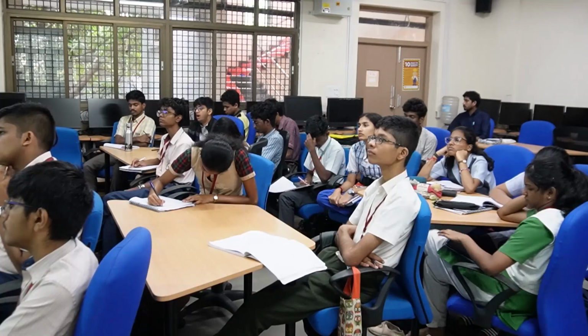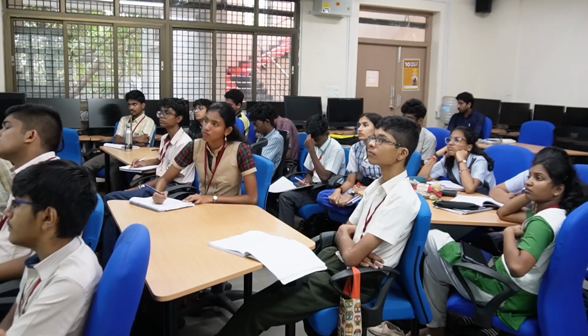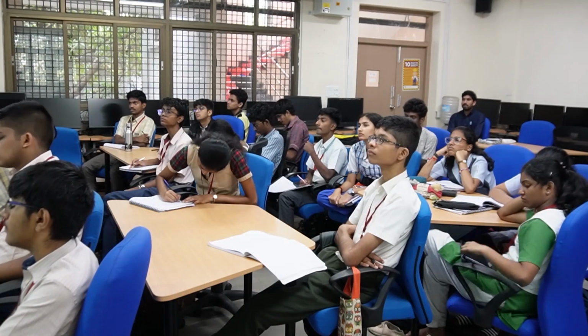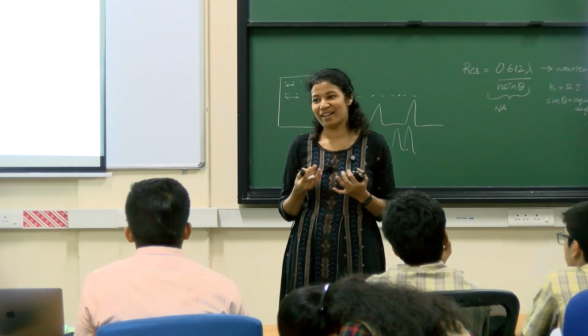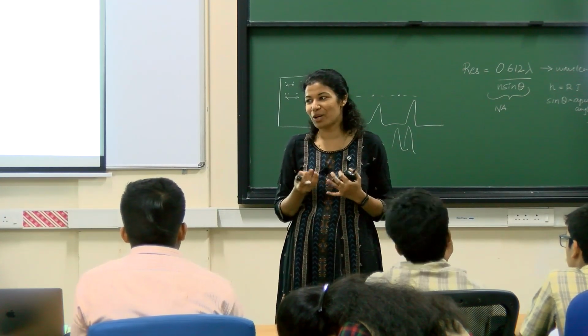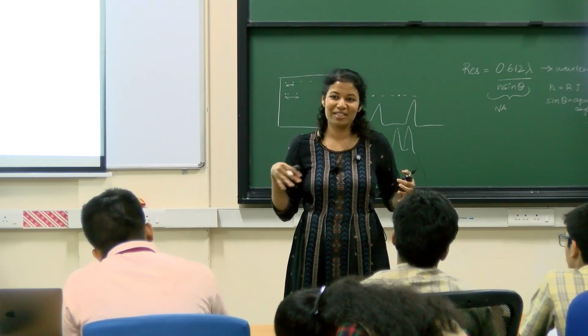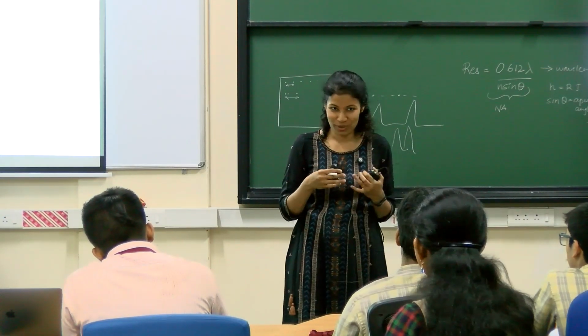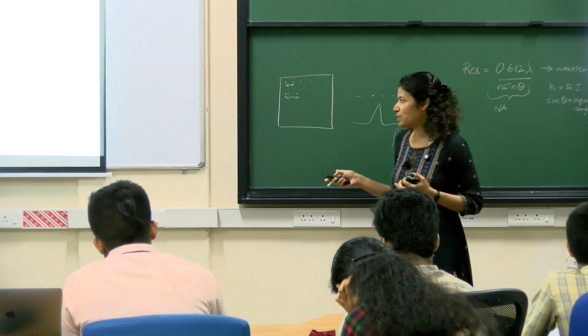So the theoretical resolution that is possible with an electron microscope is very high. You can actually go to that level, but usually we don't get information to that level because these radiations are also damaging. It damages the structure of the cell that you see. Okay, so electron is your source.